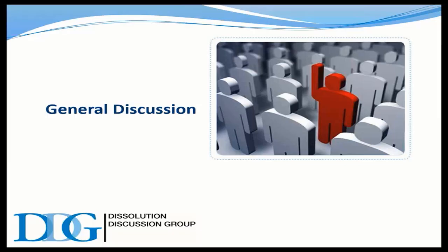That was one thing I wanted to mention. And then the other was that to get discrimination, sometimes you need to go below sink conditions. And remember, sink conditions are not mandatory, they're just desirable. Of course, the ultimate goal of a dissolution test is to show discriminatory power, and if you need to actually go below sink to show that, that is okay. Those are my two notes that I had. No, excellent. That's two great refinements right there.